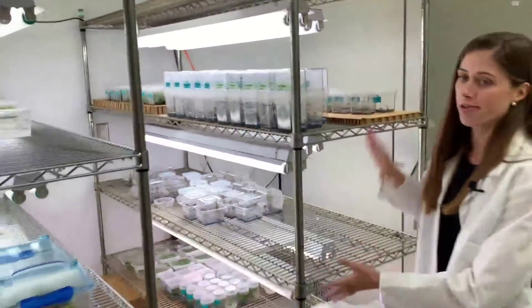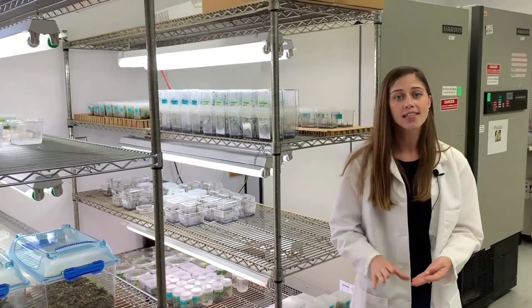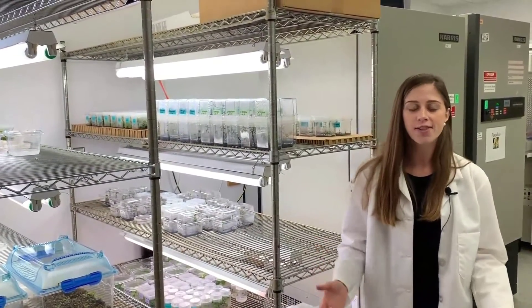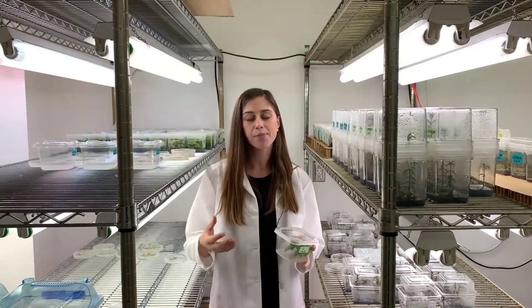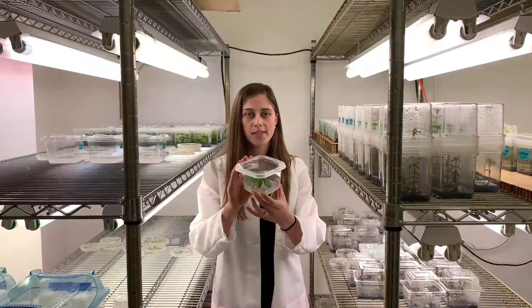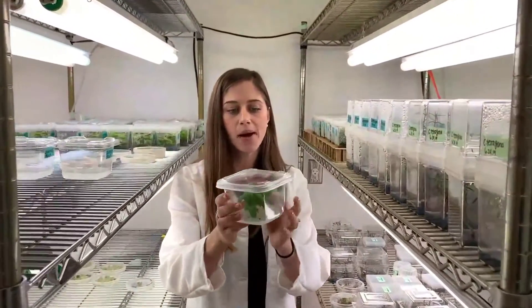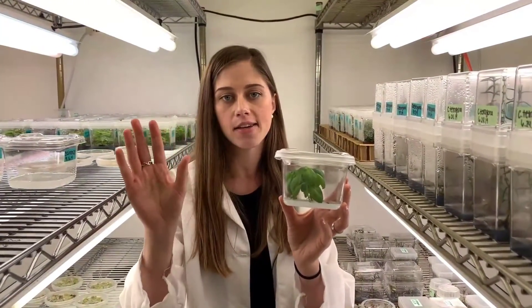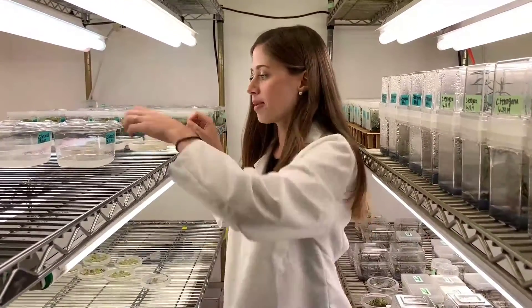Over here are our growth racks, where we grow everything from blueberries to basil to hops and different succulents, even Venus flytraps and coleus. We start off tissue culture and plant regeneration by growing our plants in a sterile environment, just like in these little Tupperware containers. This plant is not contaminated by any other bacteria or anything outside in the air. Next, we cut them up into tiny squares and place them on a plate that has growth medium and different hormones on it to mimic different stages of development.